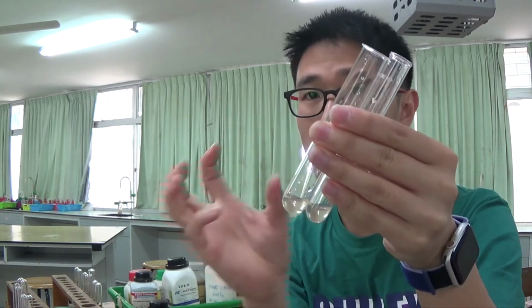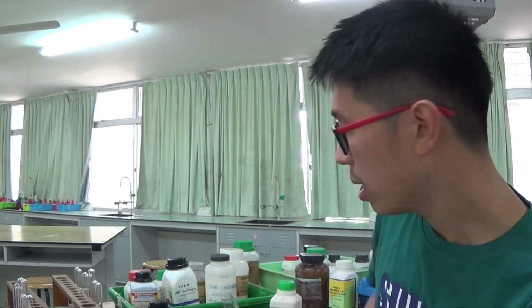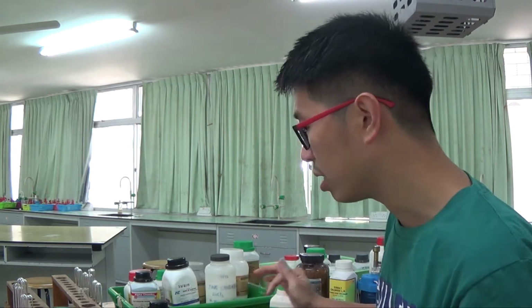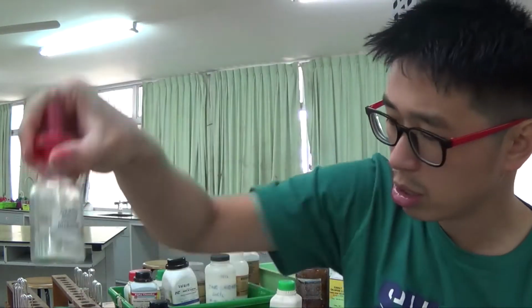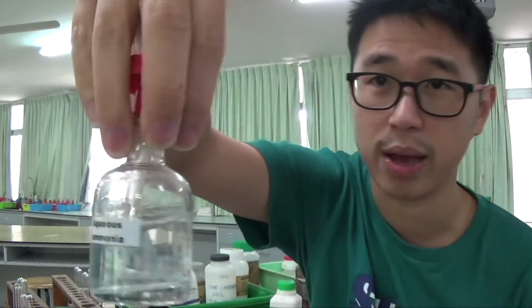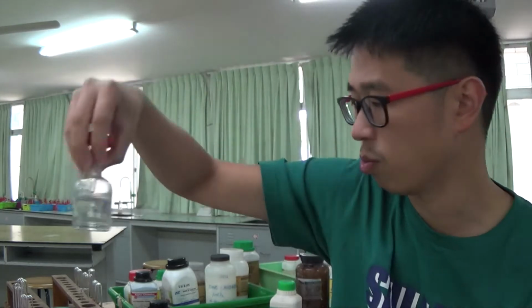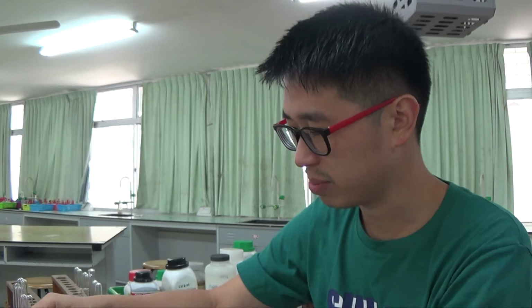They will tell me ammonia is present, that this thing also contains ammonium ion, and that was what I did in the other tutorial video when I used this iron(II) sulfate versus the iron(III) sulfate to show the presence of ammonium ion in both. I'm not going to do the ammonium test here. I'm interested in the test with sodium hydroxide, NaOH, as well as aqueous ammonia, NH3 dissolved in water. Okay, so I want to do the NH3 first.